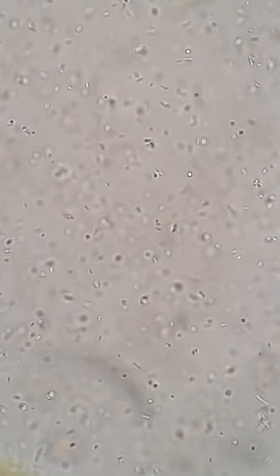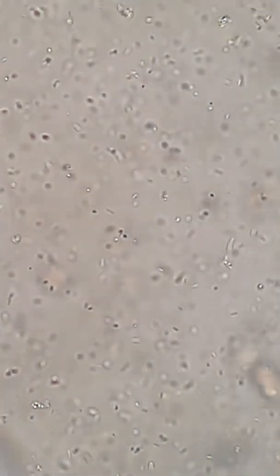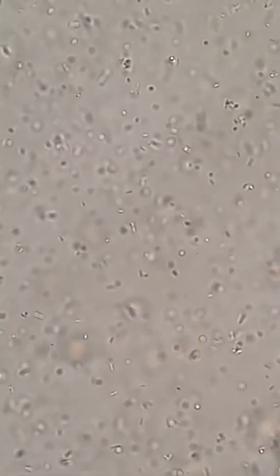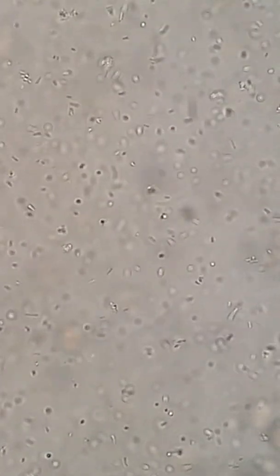Beautiful. So would I personally say that this is alive? Look at this. So this is several different strains of bacillus and other beneficial... oh sorry, I'm trying to get a good adjustment so you can see the chaining happening. There are some chained bacterias in here.